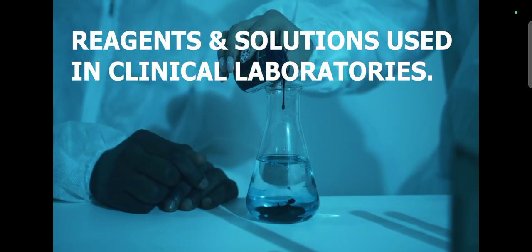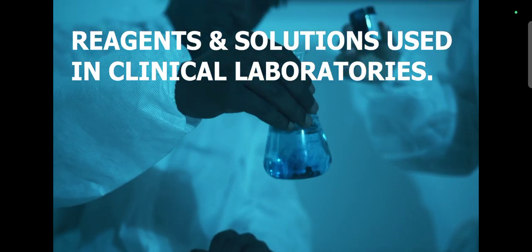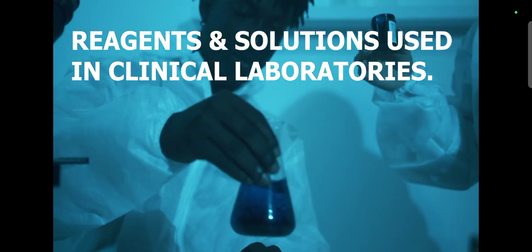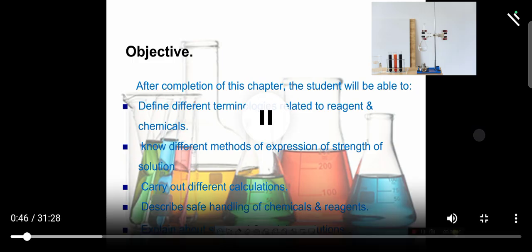In this unit we are going to study about the preparations of the reagents and the solutions that are commonly used in the laboratory. So let's have an overview of the objectives of today's session. After completion of this online session, you will be able to define different terminologies which are related with the reagents and chemicals.